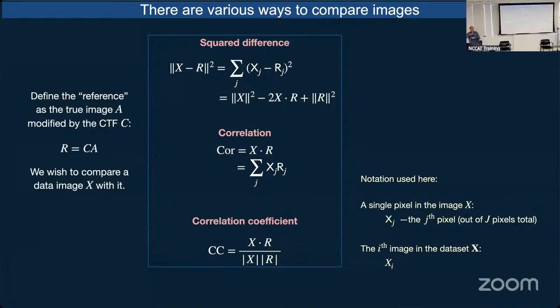The nicest way to do that is the random conical tilt method, where you tilt the specimen and take pictures, and then you untilt the specimen and take pictures and use the second exposure to determine what the spin was of each particle. Then you take the tilted particle images and you can do a reconstruction, and you know what angle in space each particle was rotated through. It was a very clever invention by Radermacher, and that's what people used to do.